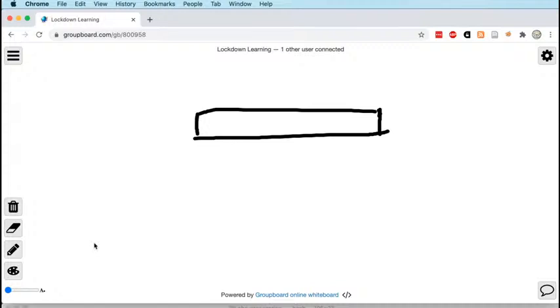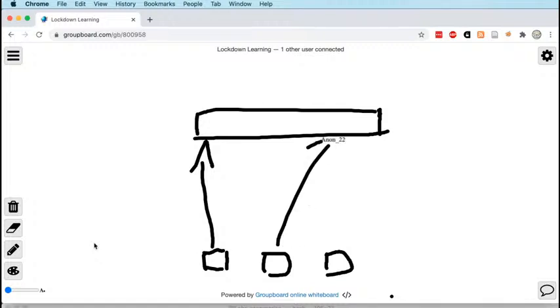So with alignment, you have some sort of reference genome, so you have an idea of what your sequence should look like, and then the process of alignment takes your reads and finds where they belong on the reference genome.